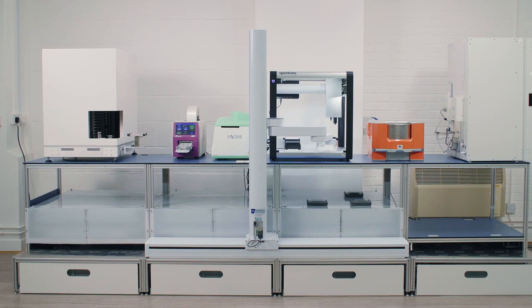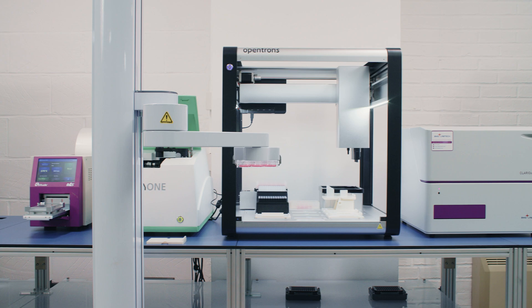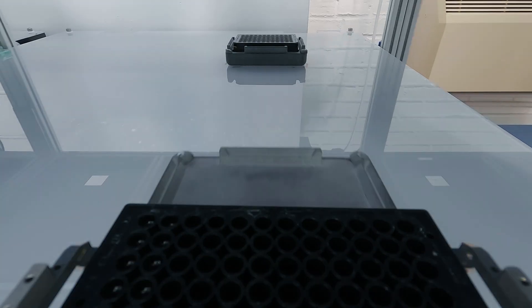The instruments will never be the same for every work cell. We build different work cells based on customer needs. If you have existing instruments, we can integrate with those existing instruments.